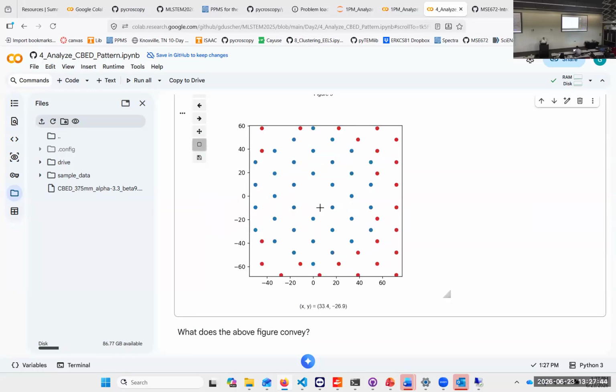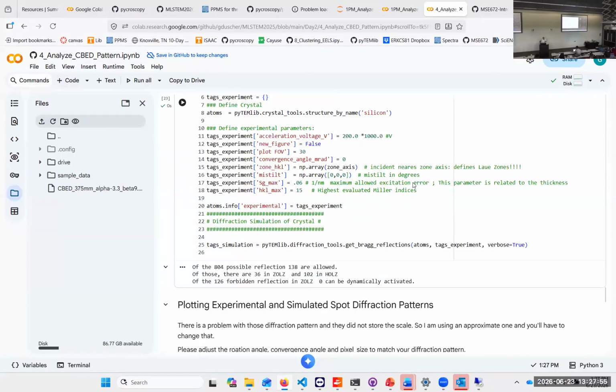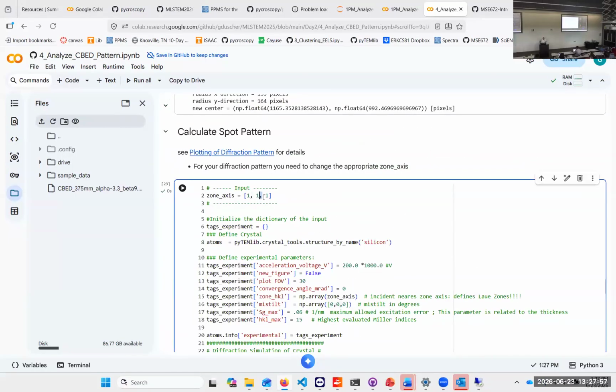And the centerpiece, immediately you see, is a hexagon, right? So the inner parts here are a hexagon. So 6-fold. Should we go to another one?